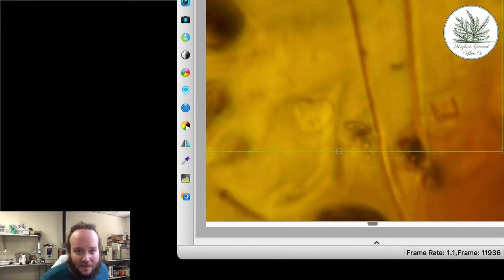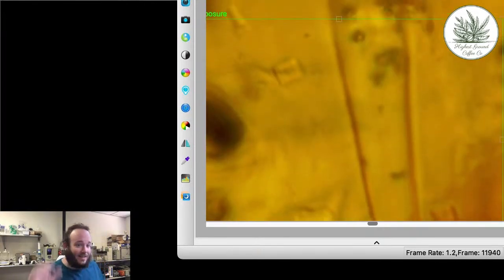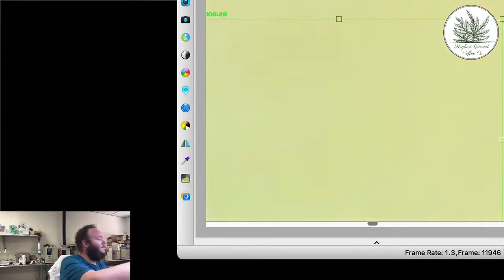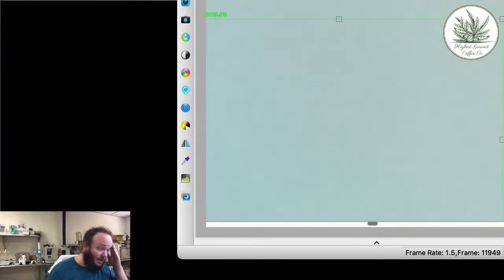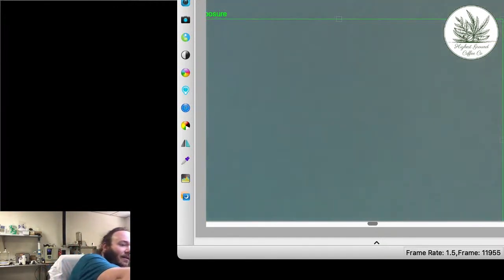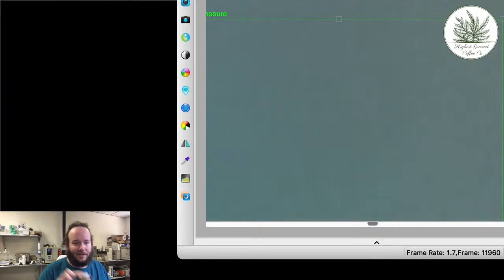60 objective. So that's cool. Let's take that out. And then I want to see, let's see. Let's take a look at what's in this guy. What do you think, Phil? What do you think we're going to see?